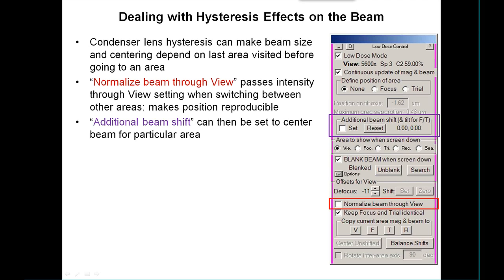This inconsistency is due to hysteresis effects in the condenser lens. The option called normalize beam through view will make the intensity go through the view area settings — which is the lowest intensity because the beam is most spread there — whenever it switches between any of the other areas. That makes both the position and size more reproducible. If you still have offsets, you then go and set your additional beam shift with that option activated.